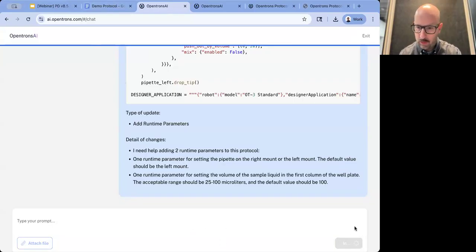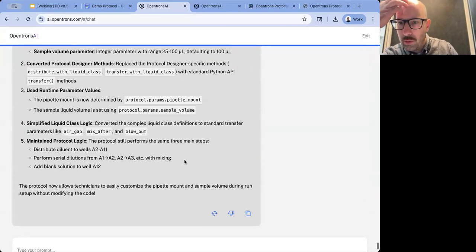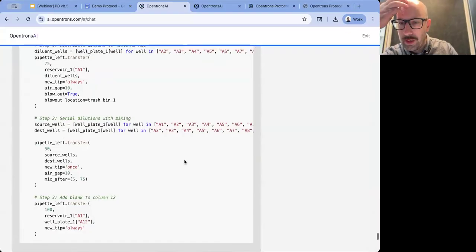Let me see if there's any questions. So I guess, yeah, maybe I can look at some of these. Can you upload a matrix via an Excel file, like a 2D table, what to mix with what, telling them where the reactants are sorted?